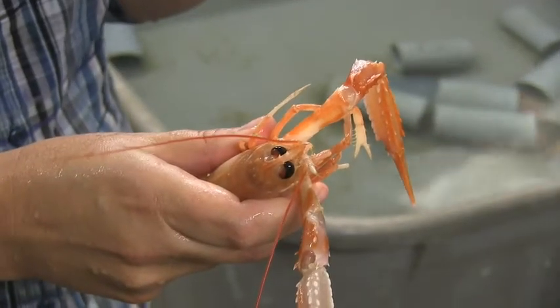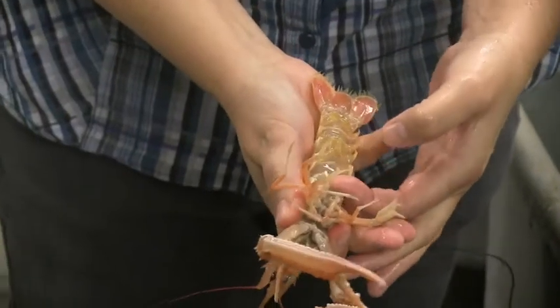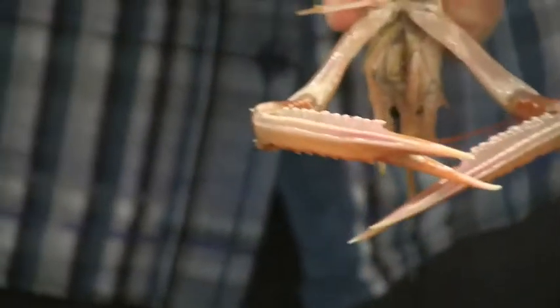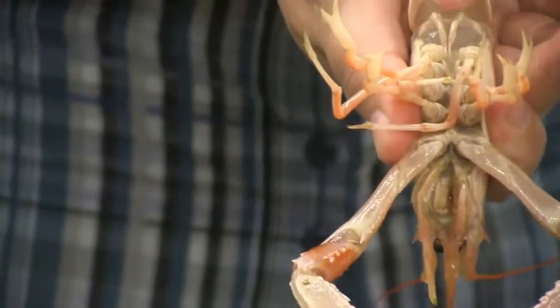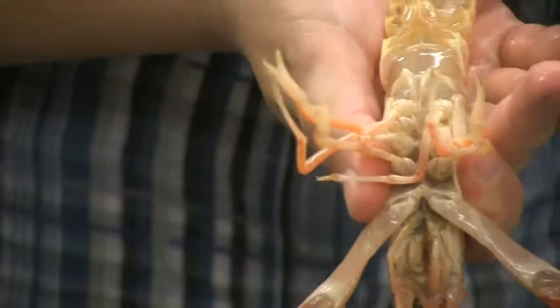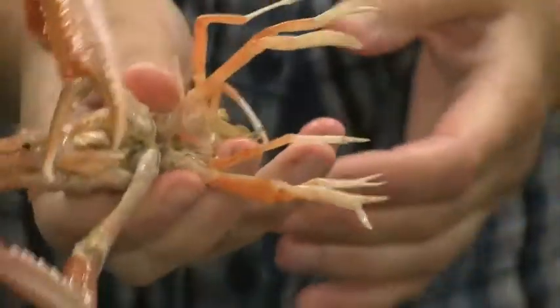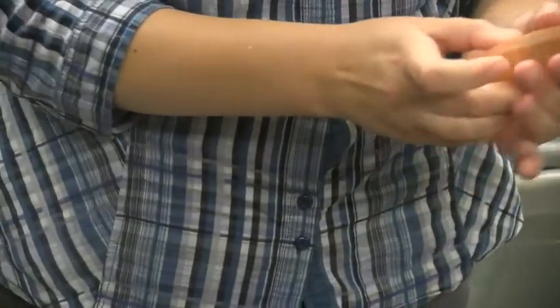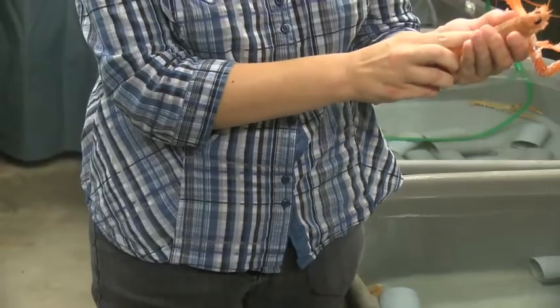So here's a male, and you can see that on these structures that they use to transfer sperm to the female. On a female, these are just like threads. And if you look at them from above, you can just barely see that the female is slightly broader.